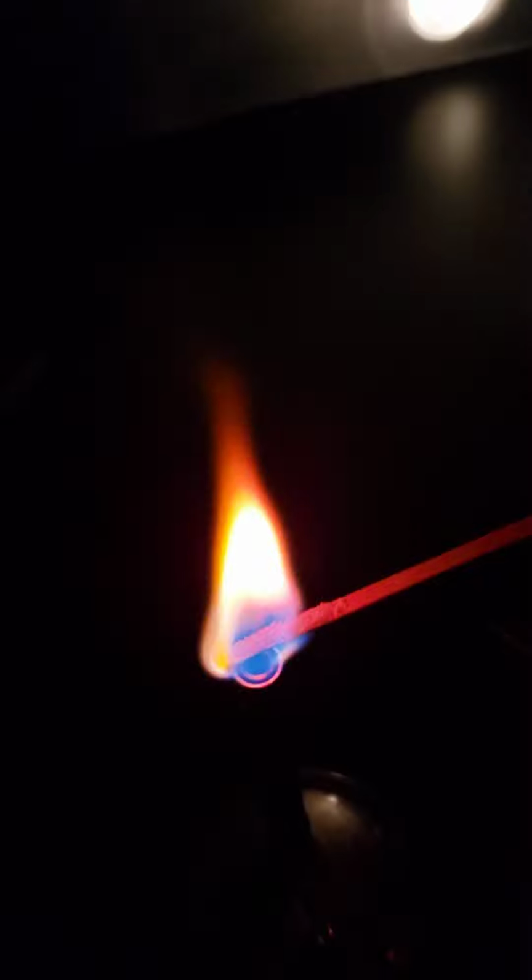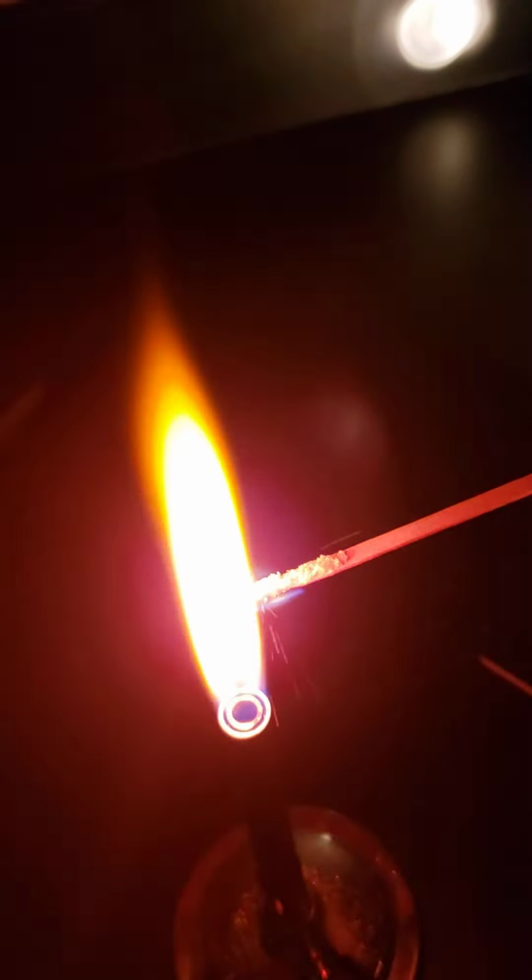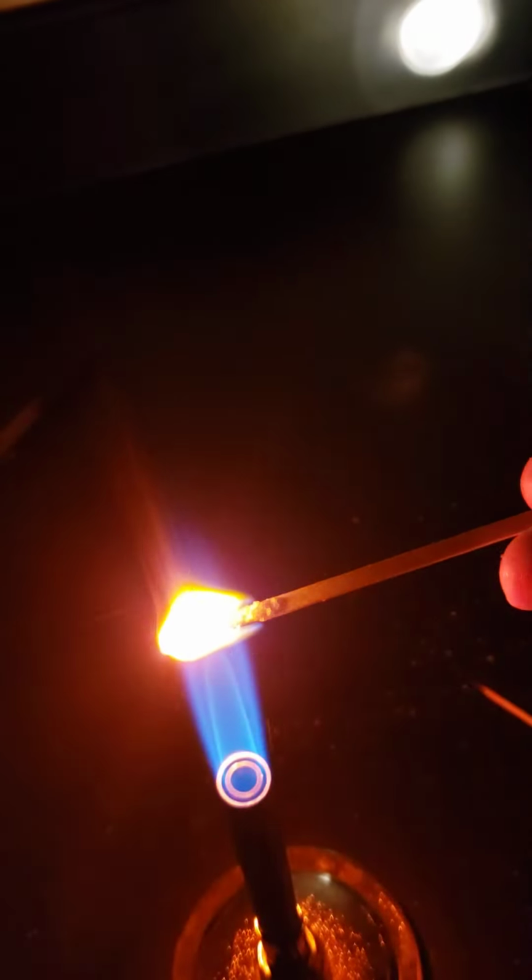Let's try the strontium, see if it's any different. Trying to get as much as I can on here. So this is strontium. Okay, then the last one is copper. So it's a different stick. Try not to contaminate here.